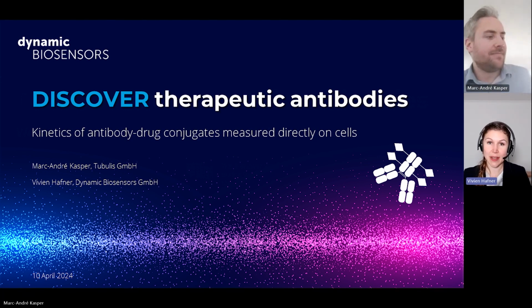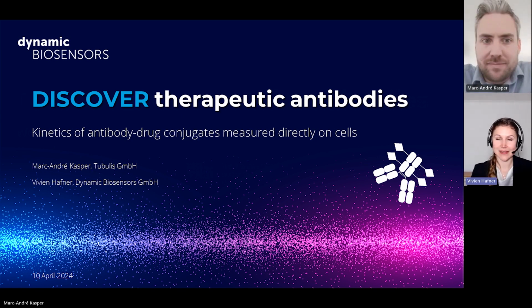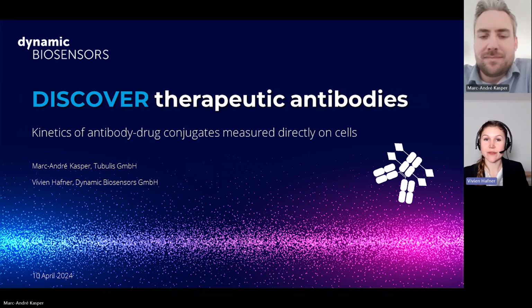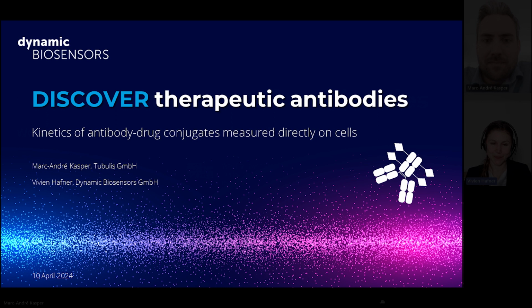And in today's webinar episode, I will just start with a very brief introduction telling you how you can measure real-time on and off rates directly on cells. And then I will directly hand over to our guest speaker today. And Marc will tell you all about Tubulis' platform for antibody-drug conjugate development and how they used RTIC in their pipeline. If you have any questions during the webinar, please feel free to use the Q&A feed or also use the normal chat function, and we will answer all the questions in the Q&A session after the talks.